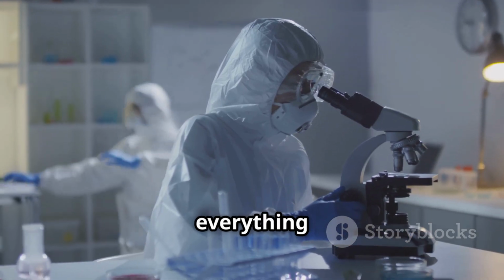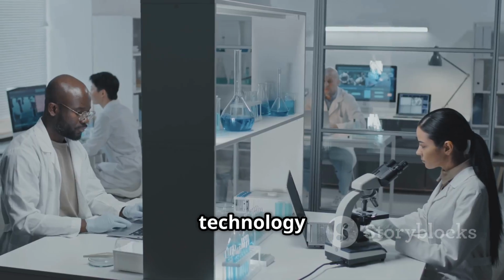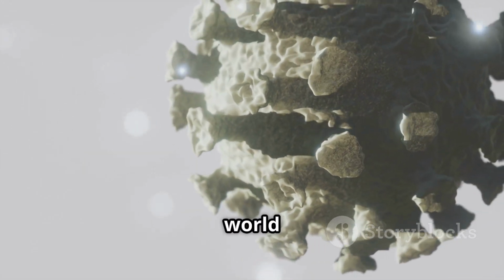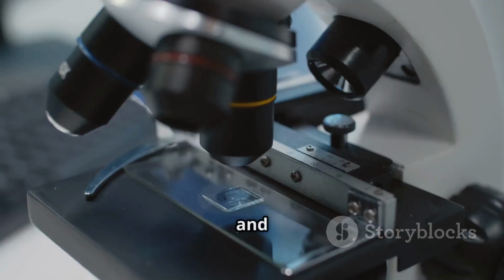SEMs help us understand everything from the roughness of a surface to the minerals in a rock. This technology is a cornerstone of modern science, letting us see and analyze the world at the tiniest scales. With SEM, the invisible becomes visible and understandable.